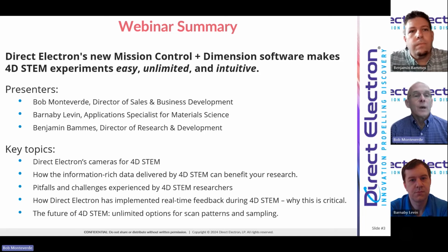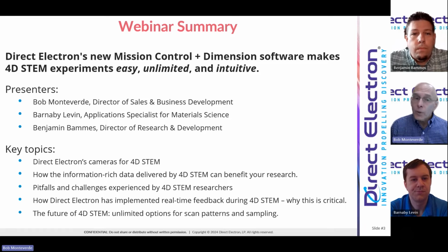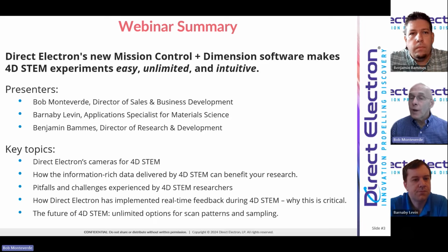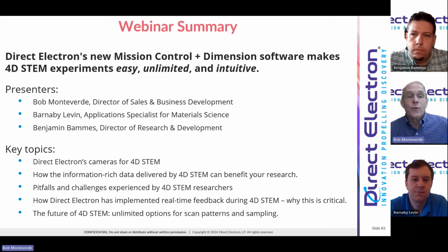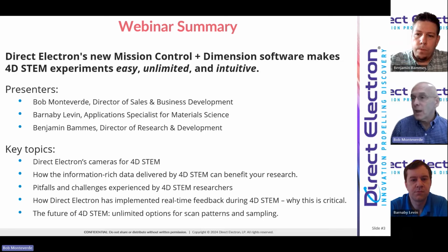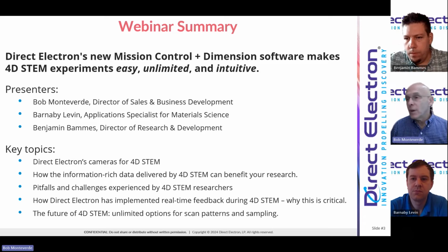control product. What we'll go over in this webinar, what you'll learn, are information about the cameras and products that Direct Electron has for 4D STEM. Then Barnaby will tell you about how the information-rich data that's provided by 4D STEM can enhance and benefit the research that you're doing.